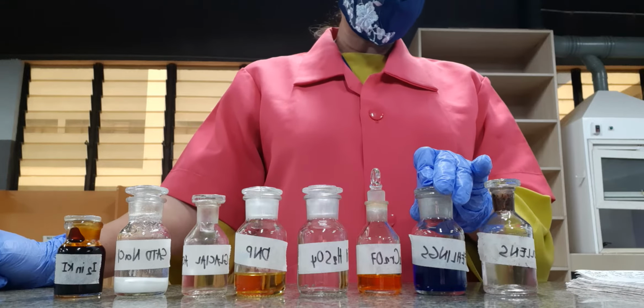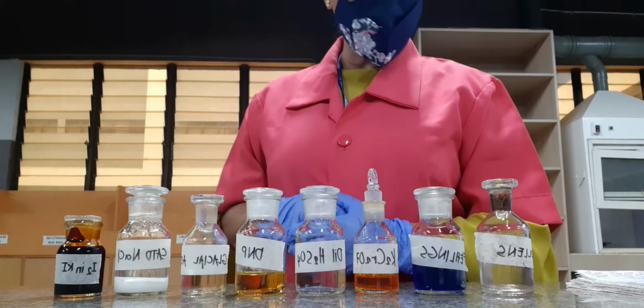the aromatic hydrocarbon, or what we call an aromatic alcohol, or phenol? Based on C6H5OH, our phenol, last time we had a positive effect. Even if it generates a blue-green solution, it will still generate a different reaction and a different product, which is benzoquinone. And yet another blue-green solution of chromic oxide.